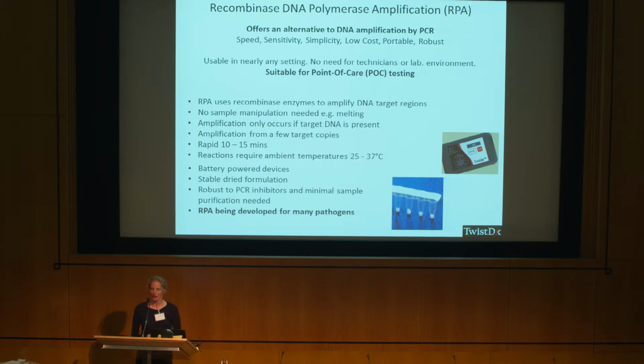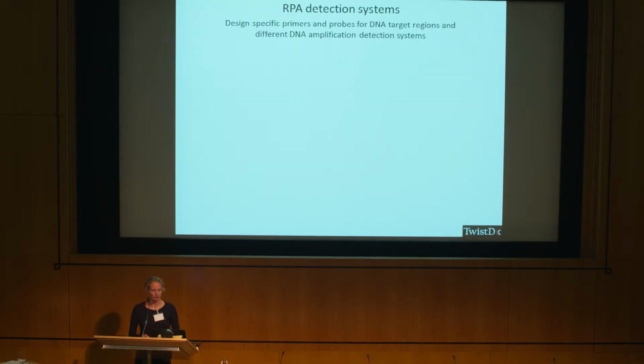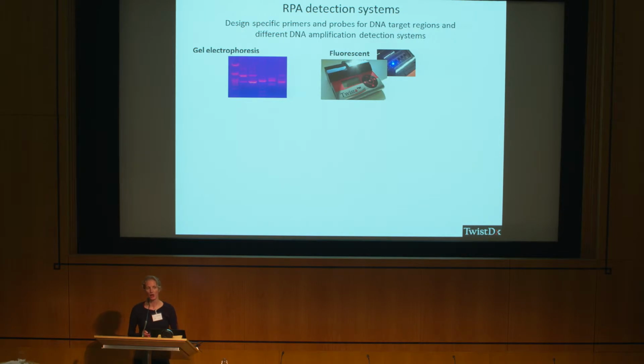So, for instance, when you have inhibitors in something like urine or stool samples that are coming through after your sample preparation, these enzymes can withstand some of those inhibitors. And RPA is actually being used for multiple pathogens now, and there's quite a lot of literature coming out about that.